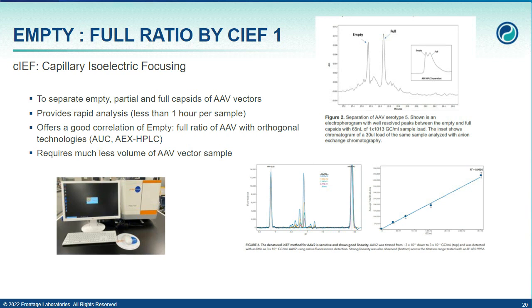CIEF offers a good correlation of empty-full ratio of AAV with orthogonal technologies. CIEF requires much less volume of AAV vector, which is a huge advantage for this method.